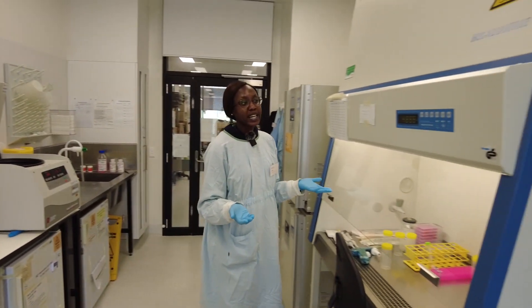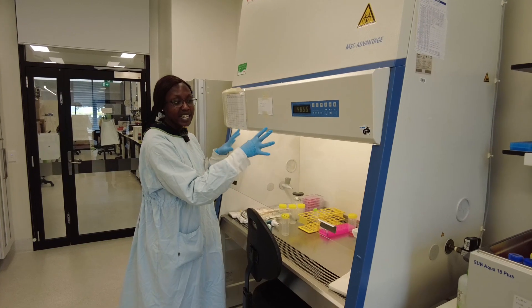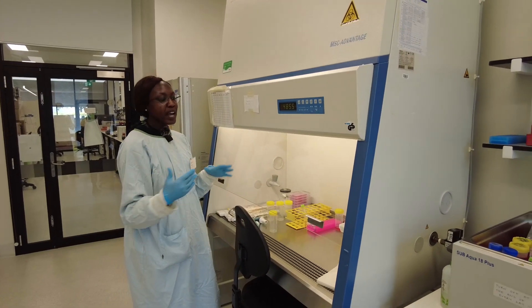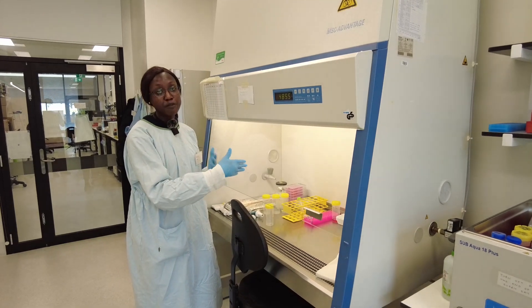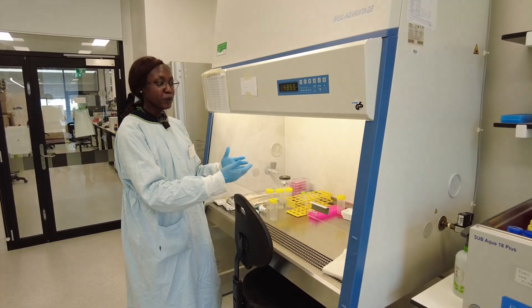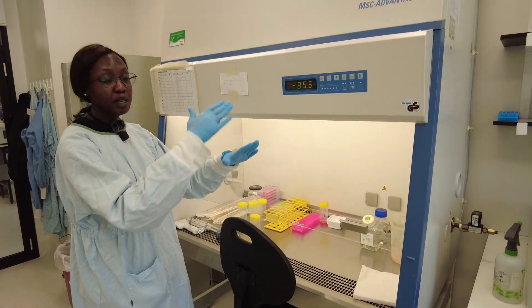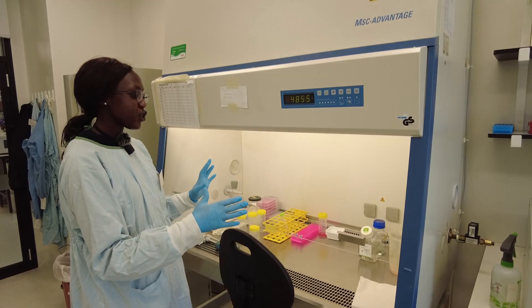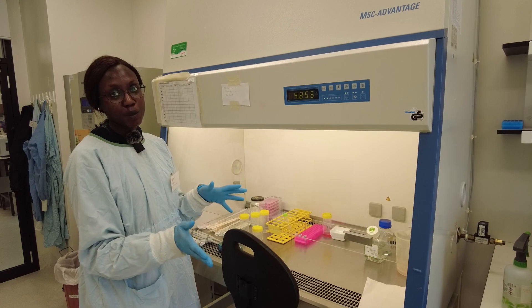The next equipment that we need is the laminar flow hood. This separates the air inside from the air outside and keeps the airflow so that no air from the outside can get in and vice versa. We work inside there and make sure that we use aseptic techniques. This technique ensures limited touch, limited crossover, and that our cells stay with as little contamination as possible.